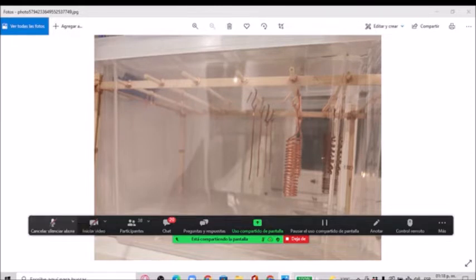¿Puedes explicar eso que dijiste recién? Sí, el zinc que no utilizas. Okay. Cuando utilizamos el zinc sin nanocubrimiento, hay que, antes de montar el reactor, hacerlo con papel de lija. When you're going to use a zinc plate or wire which hasn't been nano-coated, just put some very fine sandpaper on the surface so you'll clean it properly.